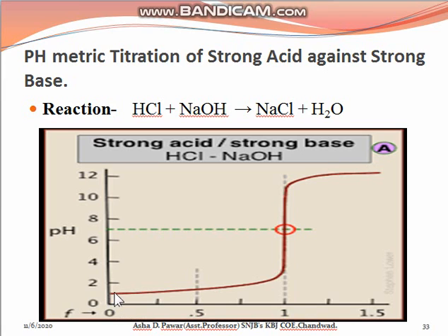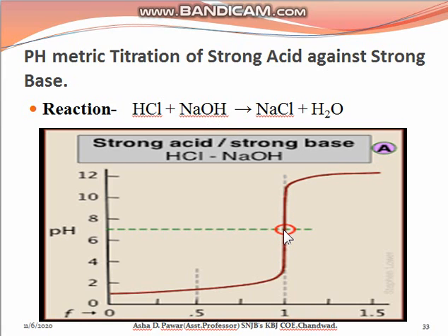The pH increases as neutralization of HCl takes place, which is clearly observed on the digital display. At around pH 7, once all the HCl is converted into NaCl, the equivalent point of this titration is obtained, because both electrolytes are strong. The exact end point for strong acid-strong base pH metric titration is at pH 7. After the equivalent point, if we add excess NaOH, the pH slowly increases. During strong acid-strong base pH metric titration, the equivalent point is always obtained at pH 7.